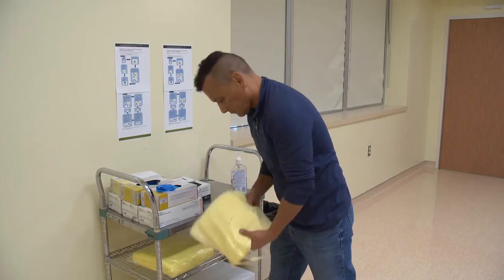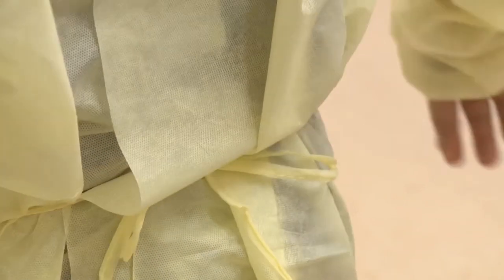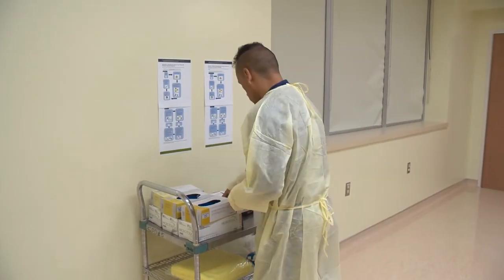Then, put on your disposable gown. Tie the neck and back ties with the gown edges overlapping to completely cover your clothing.